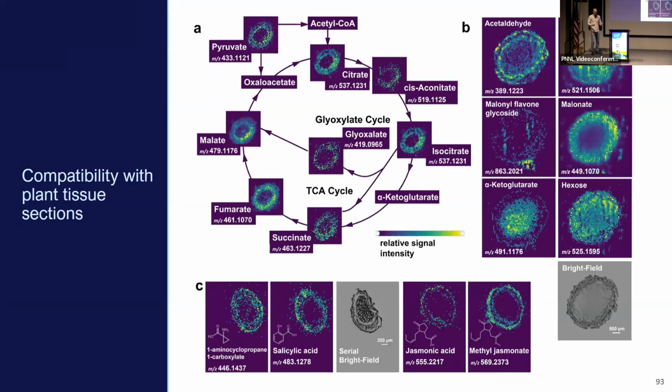And now we come to the application of this workflow. We originally designed this as part of S&T investments to work on plant systems, like on plant tissues, like root, stems, and so on. We used poplar root. We also used soybean root nodule as part of development.